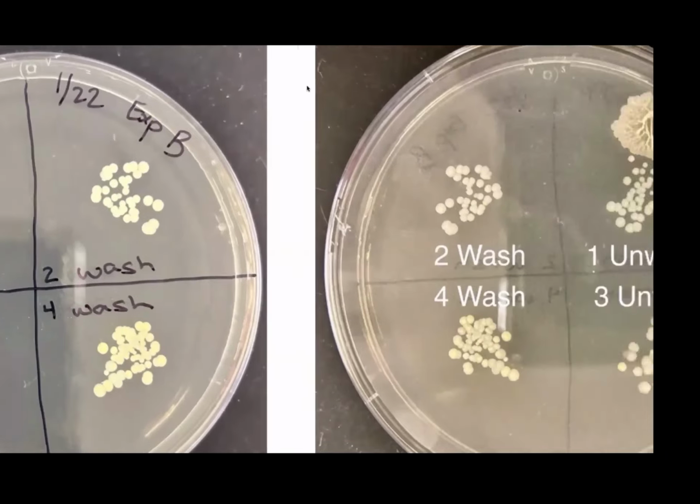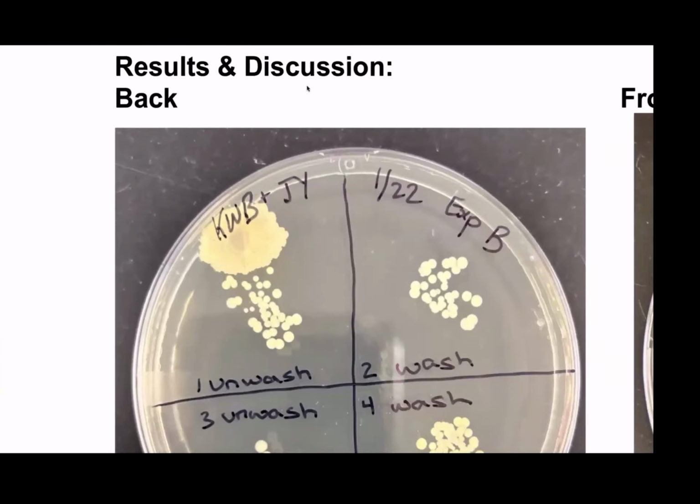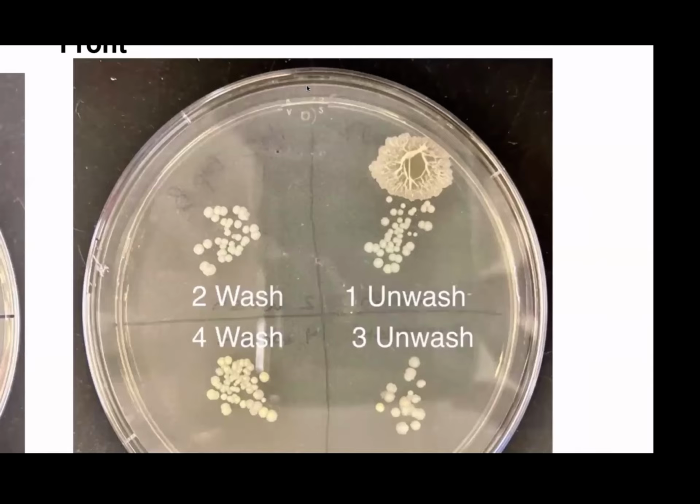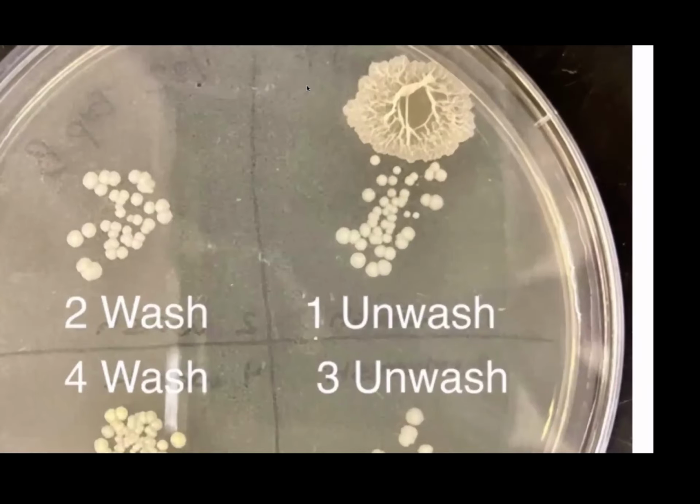So this is the same plate, but from the front. One thing you can see, this colony here, this is the unwashed, right? Can you see? There was something on the hand or that finger, and after washing, it's gone. It's not here anymore. These bacteria look similar, present on the hand. These species look the same on both sides, whether you wash hands or unwashed hand. Can you see? Because if you look at their morphology, they look the same.